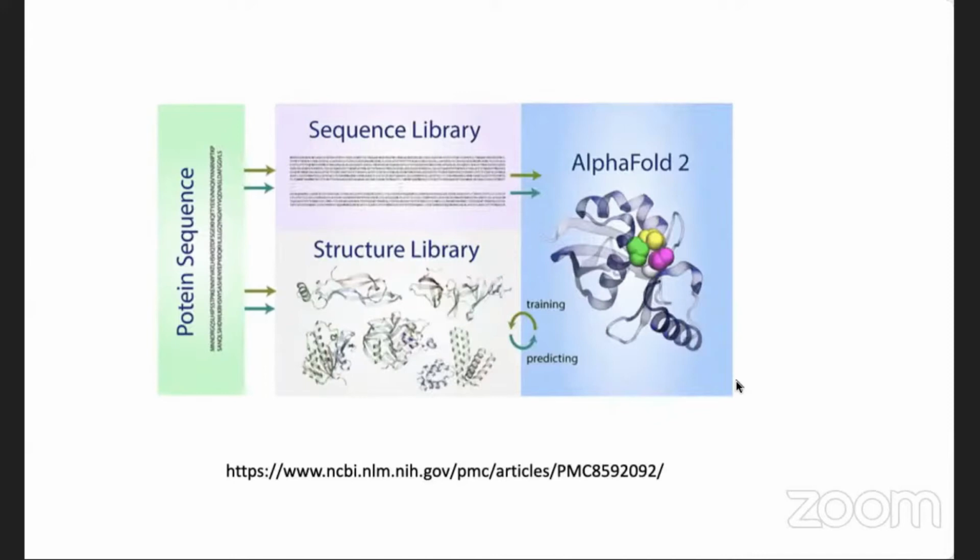When I say resolution, it means how much detail we got from those experiments, and what level of accuracy, in the context of AlphaFold prediction, is the closest to the native structure. And we do that by comparing structures. And today we are going to learn about that as well: how do we compare structures, what are the statistical values that are important to understand, how 90% similar and how 80% similar, what is root mean square deviation, all of that.